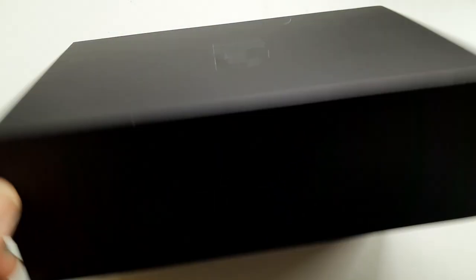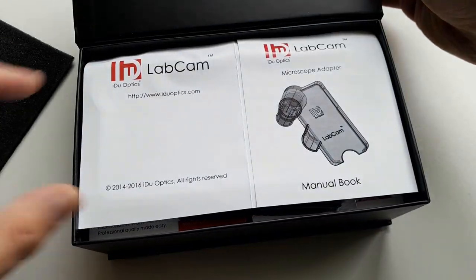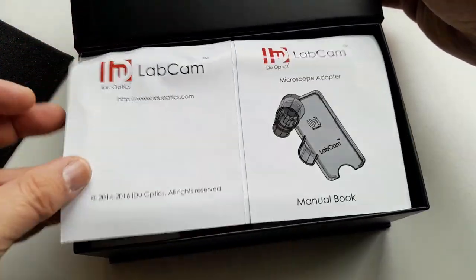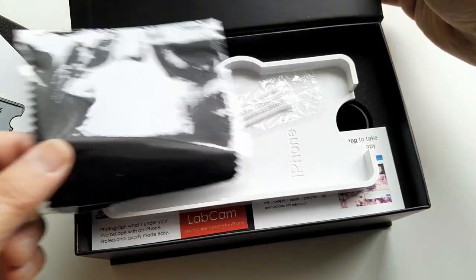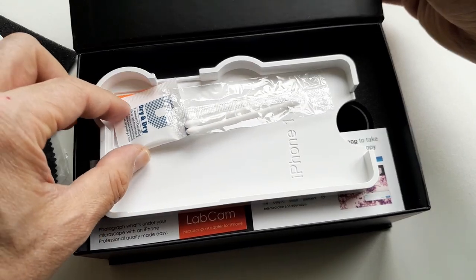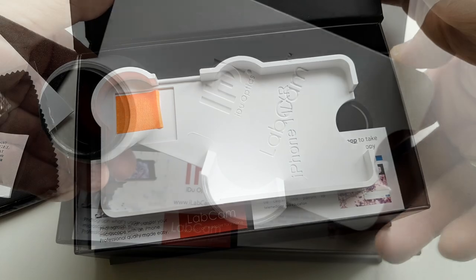Let's open the box and let's have a closer look at its contents. Everything is nicely packaged here. We were immediately greeted with an instruction manual on how to use the adapter but actually it's quite self-explanatory anyway. Some microfiber cloth for cleaning, this here is silica gel to keep everything dry and some cotton swabs also for cleaning.